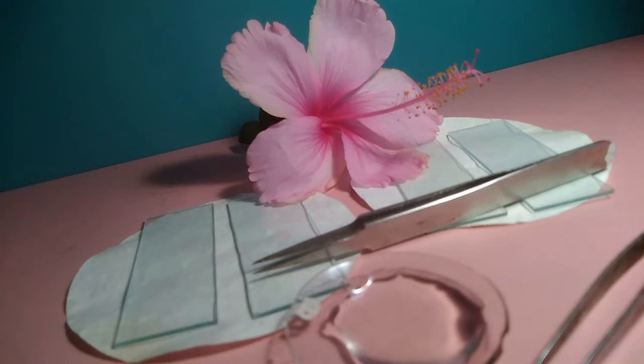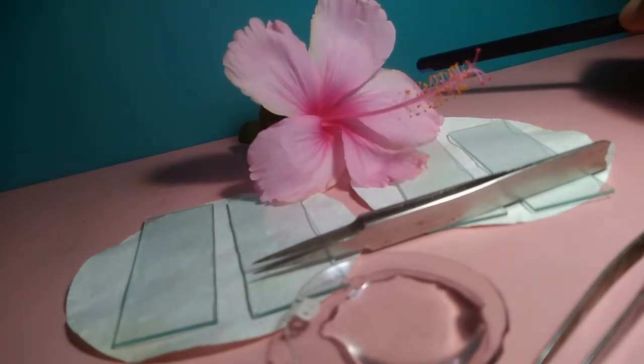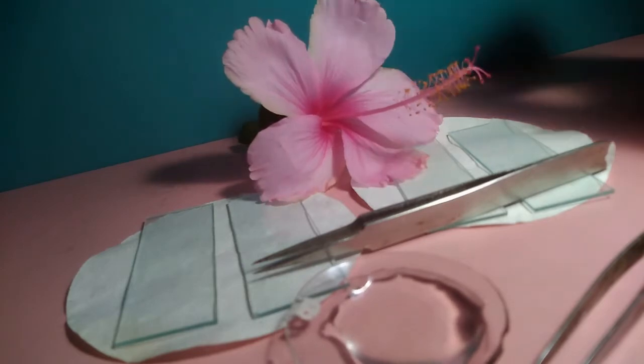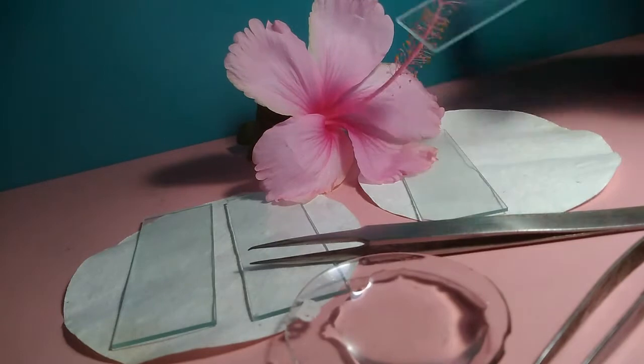So now let us quickly dissect the flower and see the structures present inside it. For you all, I have plucked one flower, but you should not pluck flowers unless it is absolutely necessary for you. And apart from the flower, we have some clean and dry slides here. These are just rectangular pieces of glass.